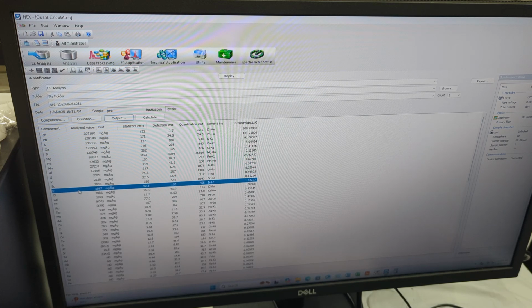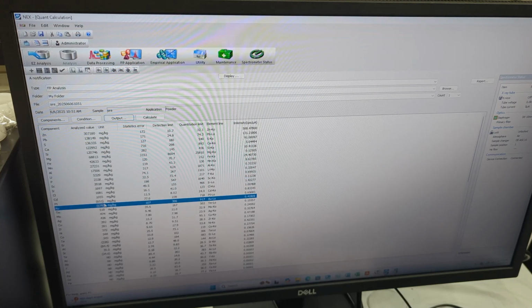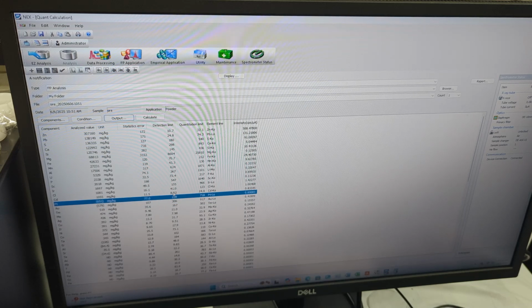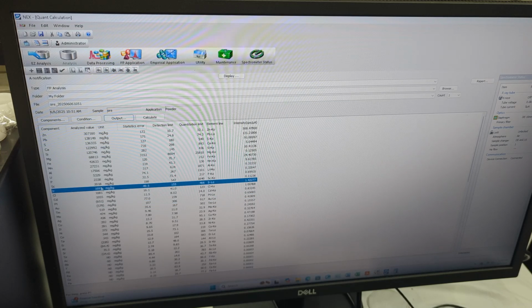But what's really interesting is this. It's showing us iridium it has in, and then also platinum and gold, but whenever you see that parentheses, the commas, that means it's within the margin of error. If you see the margin of error here, it does all this calculation by itself, and I'll show you what I mean, or why it says this. But yeah, pretty much it shows you its calculated margin of error. And again, I would never go based off any of these results immediately, blindly, by themselves.